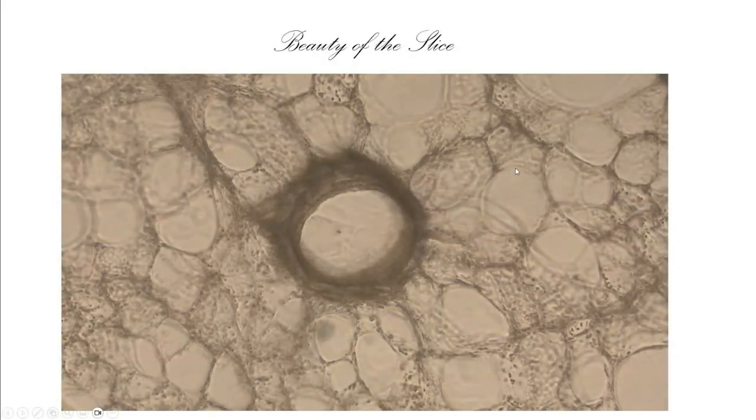Inside the alveoli, you may have interstitial tissue between the various alveoli that is connective tissue. And the beauty of the slice is not in the alveoli, because those will mostly be shredded during the slicing process because they're so large.